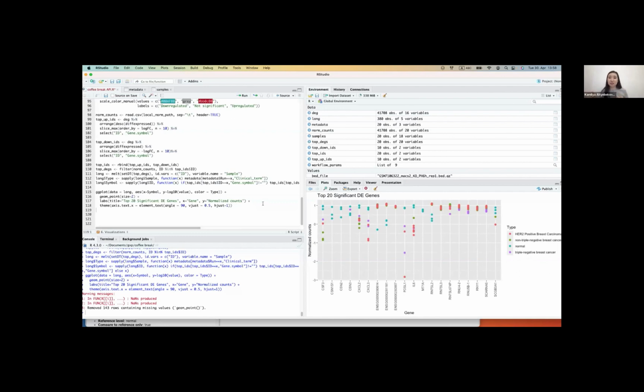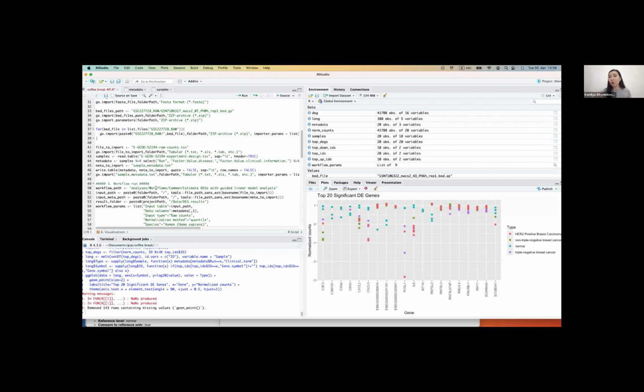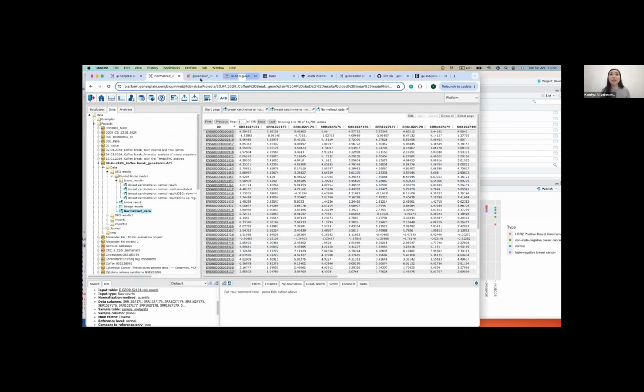So as you can see, what we did: we had some data locally, we uploaded it into the platform, we did some manipulation in the platform, then got the results locally, analyzed them more and added some more functionality to the platform. So again, you can use it for uploading a lot of files together at once and doing more manipulations, running more workflows and analyses one by one. I will quickly show another example.